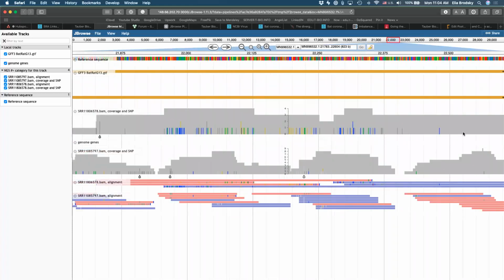The other question is, just to clarify, whether the data we got from RNA-seq is significant for presence of virus based on number of reads and not the percentage. Okay, yes, and we'll talk about that. That is a part of the SF9 project. We'll take a look at some examples to see, do we know that this is actually the full genome present here, or just some random portion of the genome? As we saw in the previous example with the cell lines, you get over 90,000 reads at the end.